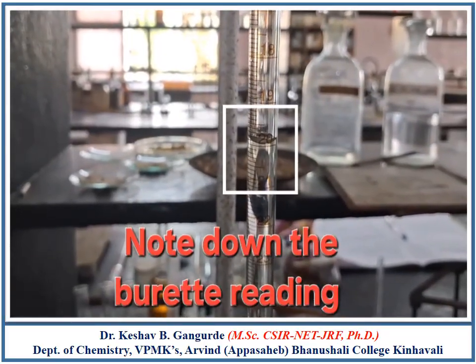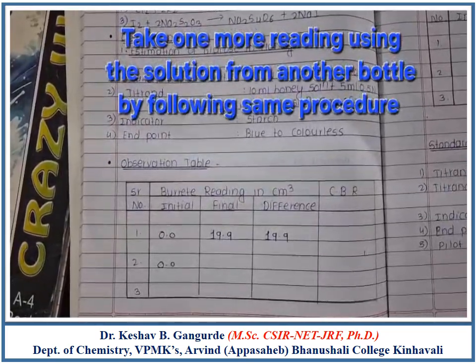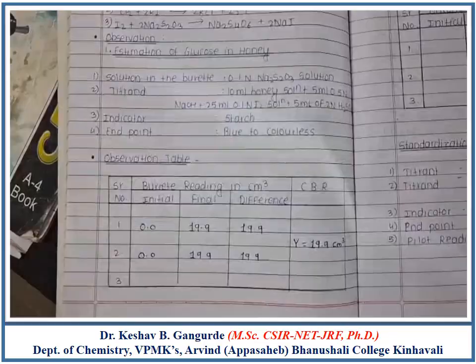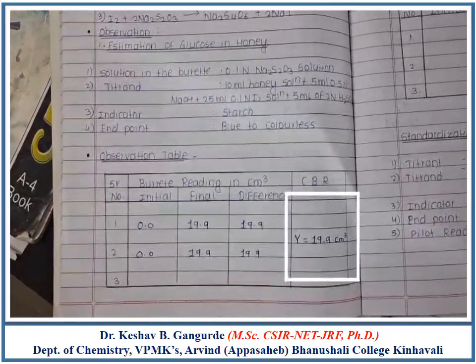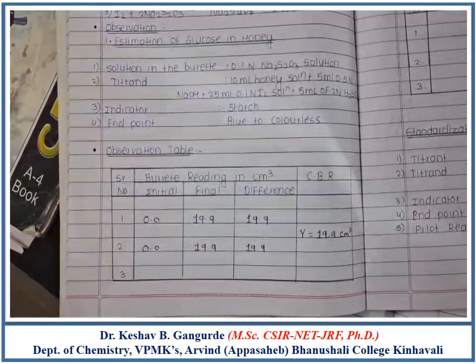Note down the burette reading. It is 19.9 ml. Take one more reading to get CBR or MBR. The second reading is observed to be 19.9, hence constant burette reading 19.9 centimeter cube. Note this reading as Y.